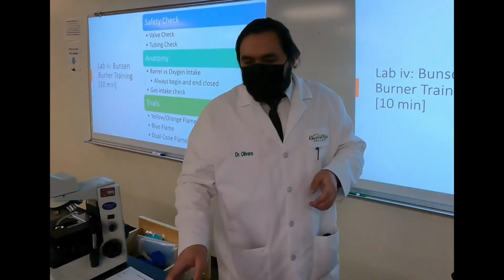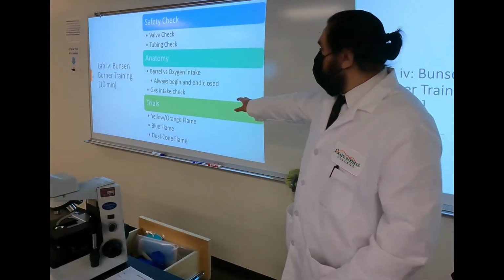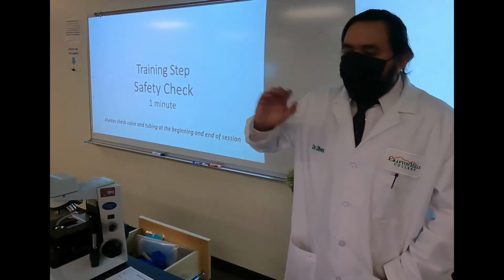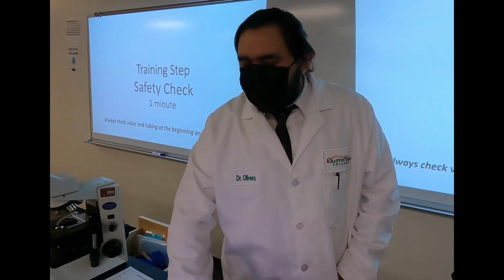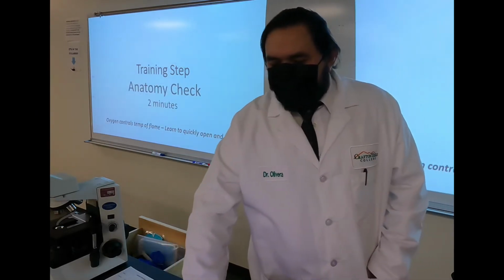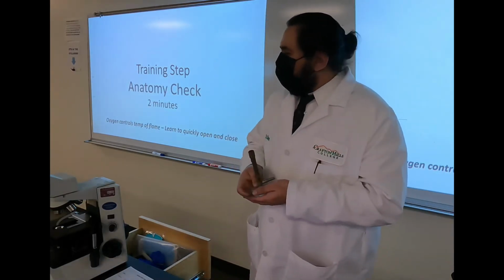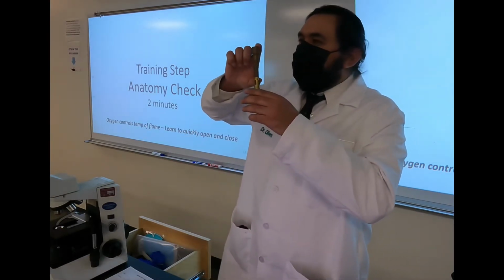Now with that being said, then we want to go through the anatomy, which I'll go through in a moment, and then we're going to play with all three stages of the flame. Okay, so hang in there for that. So again, let me demo, then you can follow it. So check, obviously make sure that the spigot is closed, so the valve for the gas is closed, and then let's go through a breakdown of the anatomy really quick. Whoops, went too far. So for the anatomy, I have a loose one over here so I can mess with, since my projector is not working over here. You have your barrel.